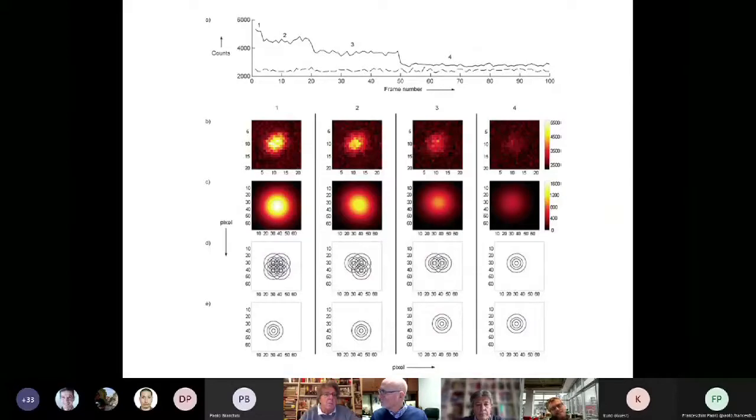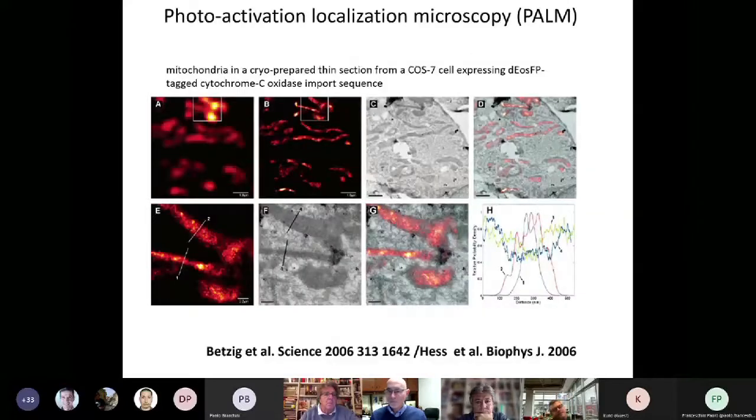But I think the problem with these prior publications is that they don't provide context, and that's of course very important. If you think back, the image of this dendrimer or the image of that piece of DNA is just a collection of dots, and that doesn't appeal and doesn't say much to people not working in the field. So the real clever thing of Erik Betzig in 2006 in this paper on PALM microscopy, in my view, was that he provided context.